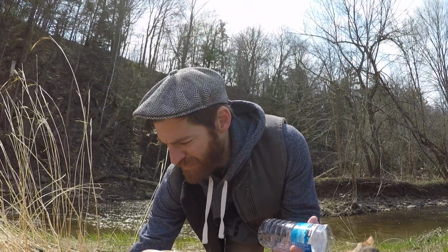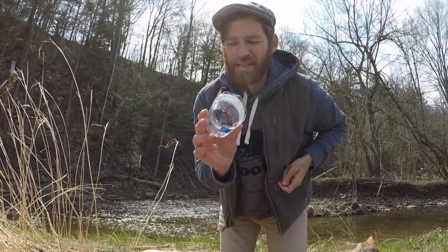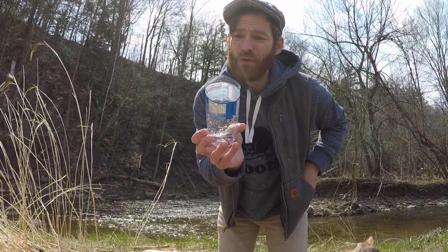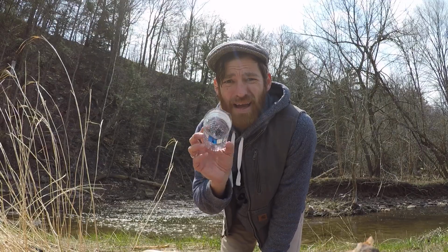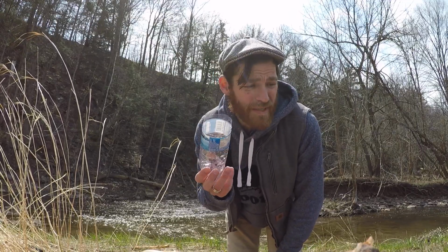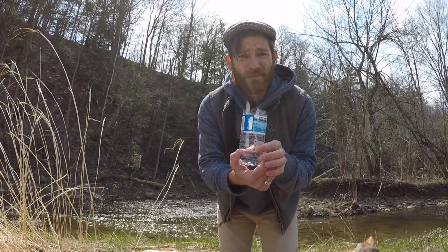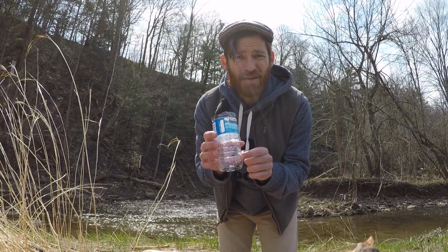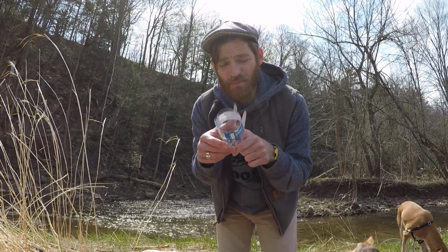Again, now that I have my tube, the idea is we're going to fill this up, and hopefully before it gets to the top, we'll be able to have the bottom obscured from us. And the more crap that's floating around in the water, the faster this is going to disappear. So if we put in 2 centimeters, if it's really turbid, we won't be able to see the markings that we did on the bottom.